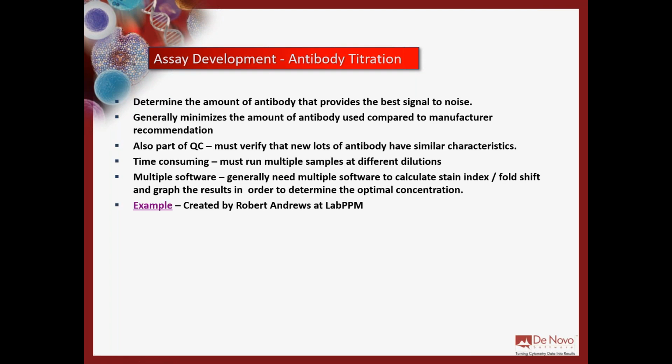Okay. So some other ways that FCS Express can help with your quality program is validation and qualification of your reagents. One of the things that is very important is the antibody titration assay. You always need to titrate all of your antibodies before using them in an assay, and also when you get a new lot in general.